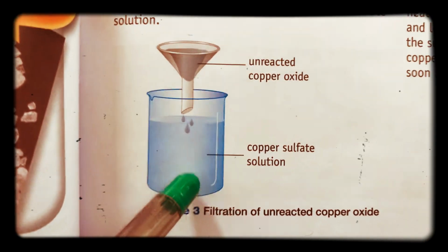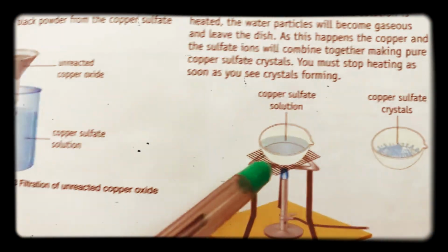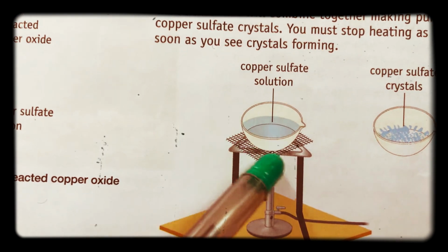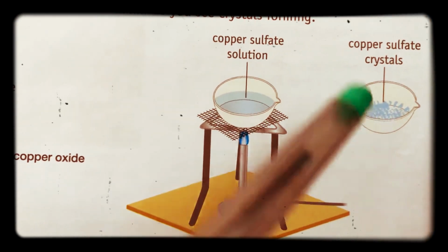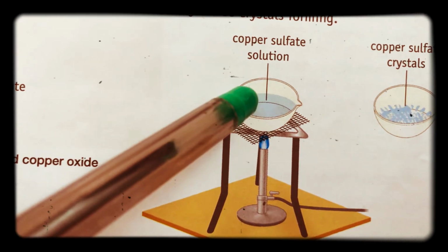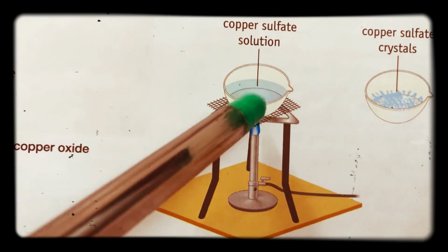The next stage is to separate out the water. Okay, so what we can do is we can get our sample and we can slowly and with control heat it using an evaporating dish here. It's called a basin, evaporating basin as well. And if we heat it, then we can start to remove some of the water. The water evaporates.